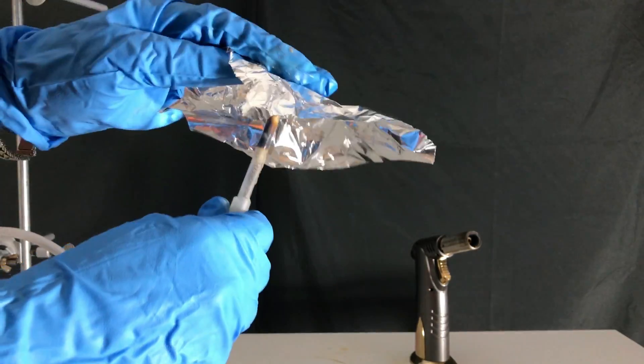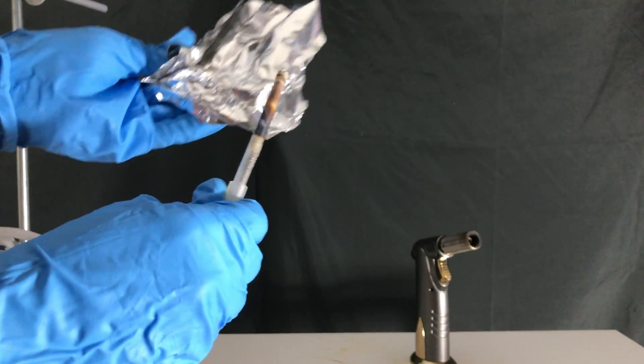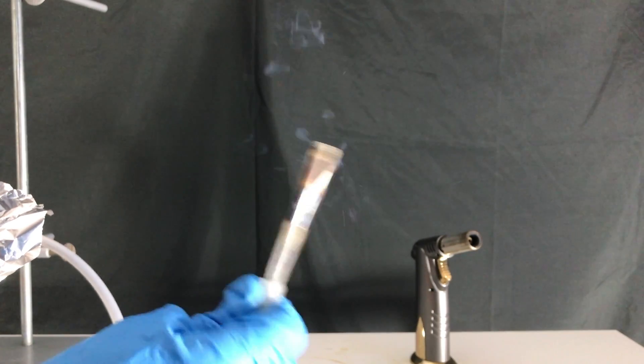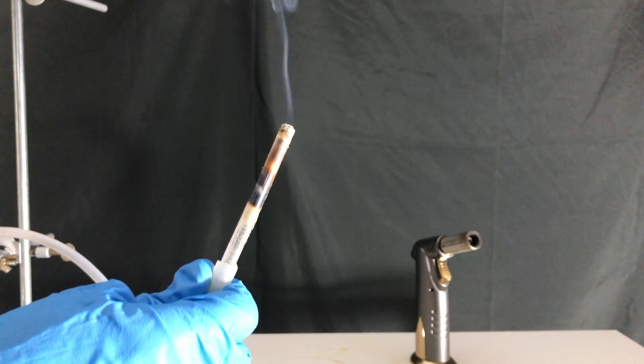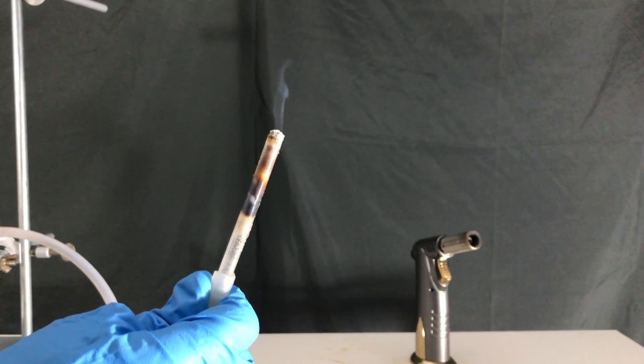To show you the pyrophoric properties of silane, I tried to extinguish the flame using aluminum foil. You can see that silane doesn't always ignite, but when you turn up the flow of silane, it will ignite by itself, as you can see here.